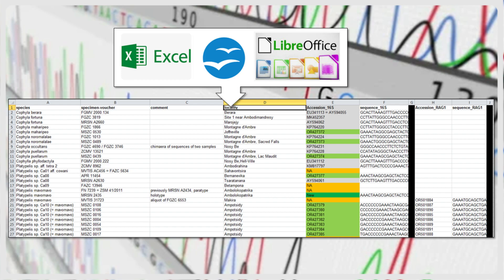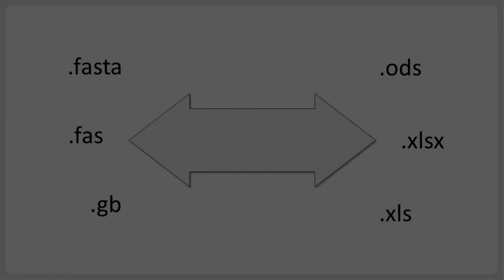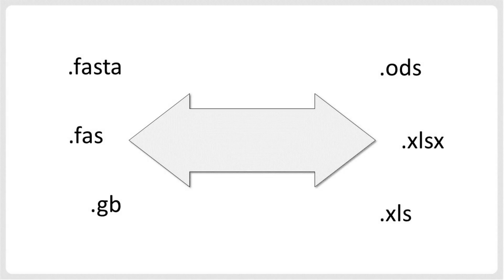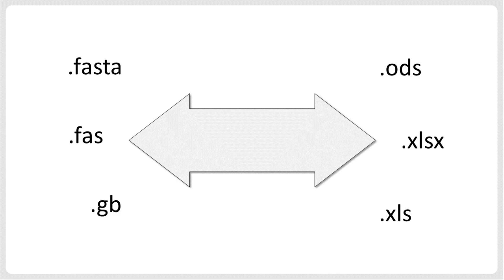Of course, you need to get the sequences into the spreadsheet first, and iTaxoTools helps you do this. Before introducing DNA Convert, a tool that can help to get DNA sequences into spreadsheet editors, let's have a look at different table formats.